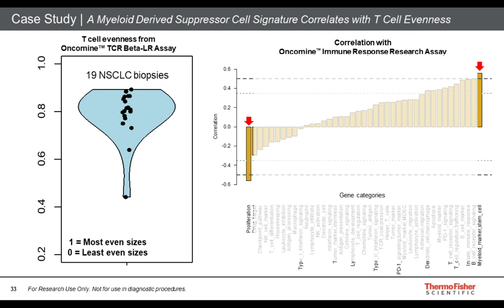And Dr. Cawley, it looks like we have time for one more question. Is there any overlap in the content from the Oncomine TCR beta long read and the Oncomine TCR beta short read assay? Yeah, I mean, they are essentially both amplifying overlapping regions in the T-cell receptor. So the long-read assay works only on RNA, and it's amplifying a longer region that includes CDR3, but also CDR1 and 2, whereas the short-read assay also operates off of RNA and can also work on DNA, and it amplifies just CDR3. So the content that both of those panels amplify are, one is a subset of the other.